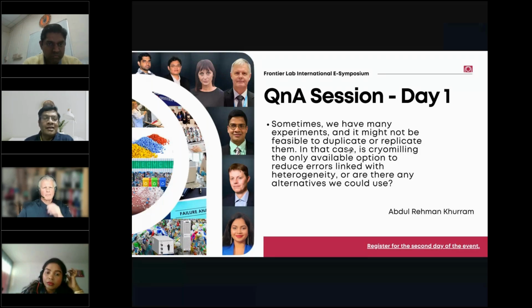Yeah, I think this is a very difficult question to answer. As I said, you gain the expertise through experience, where you can really make sure that you are able to get the best sample for your analysis. But if you have a cryomill, that really simplifies the workflow for users.